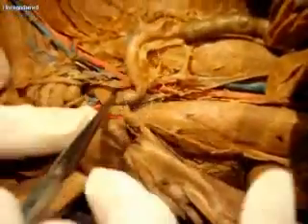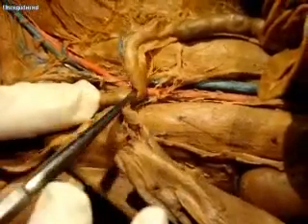So then we'll go back to the blood vessels for a second. So again, iliolumbar artery and vein right there. And then this continues on. This is going to branch. So now the inferior, or the abdominal aorta, is going to split to form the common iliac arteries, and the inferior vena cava is going to split to form the common iliac veins.